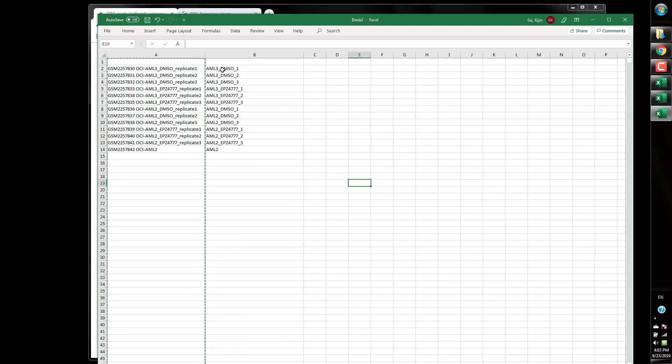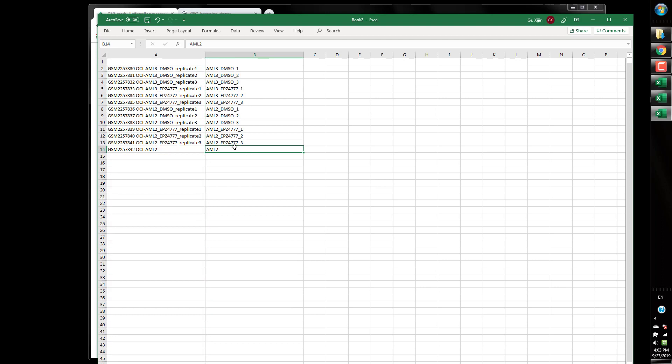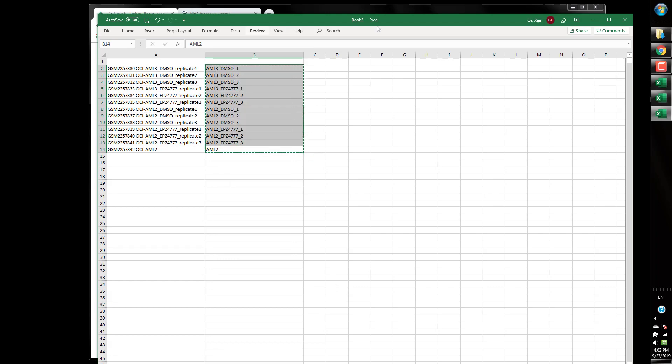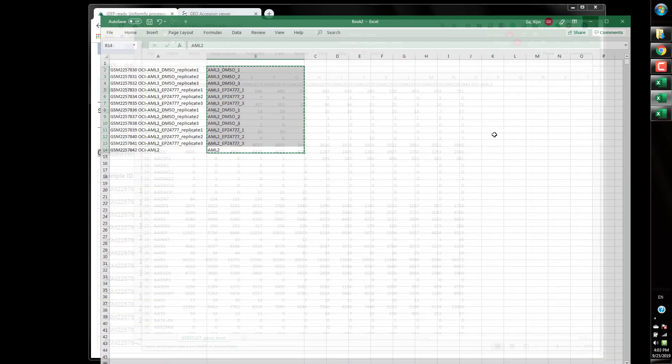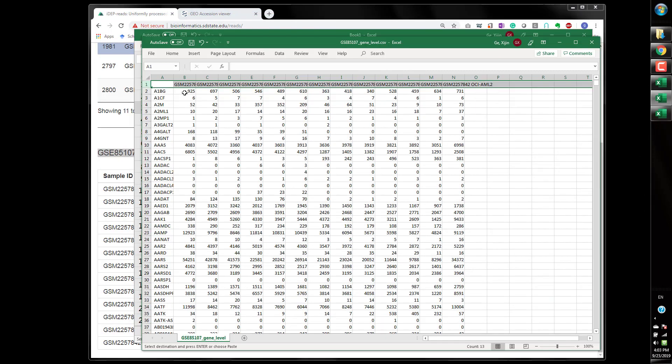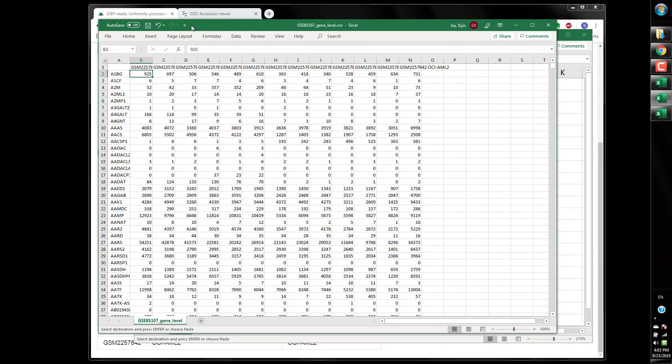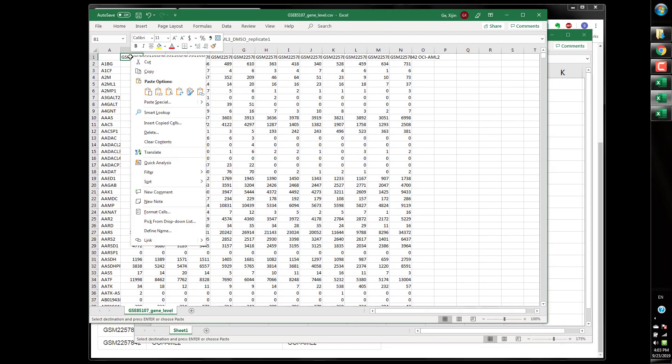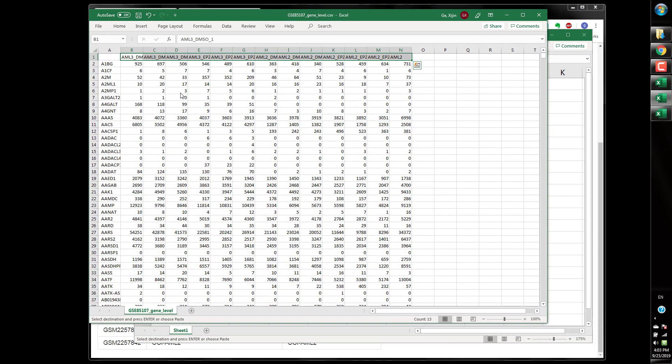Now this is very good we can use this as sample names and this sample is kind of odd but we're going to copy this and paste to our original data files as transposed. All right you can see these guys are lined up pretty good.